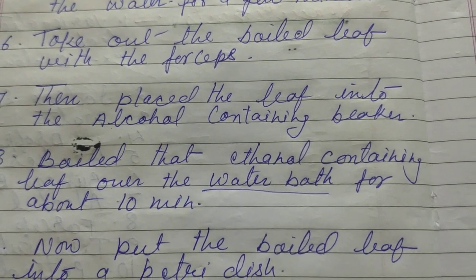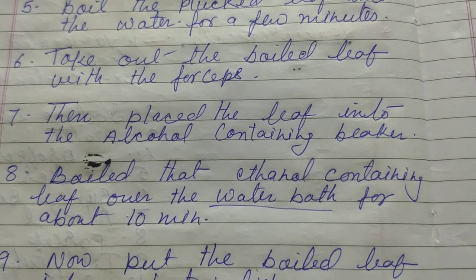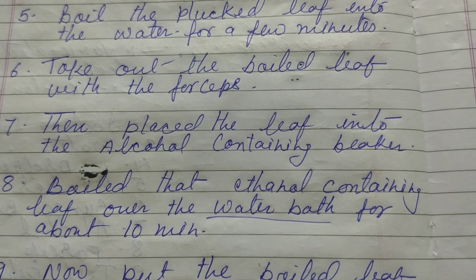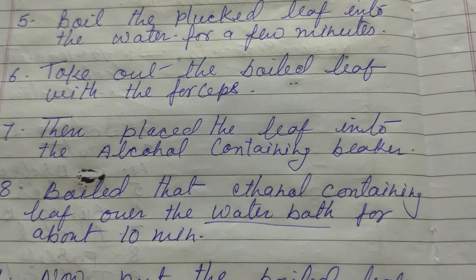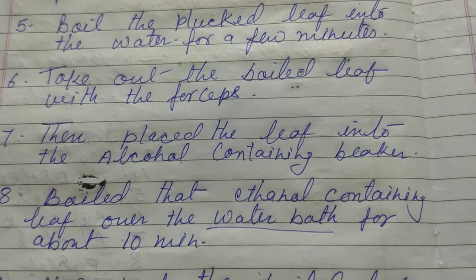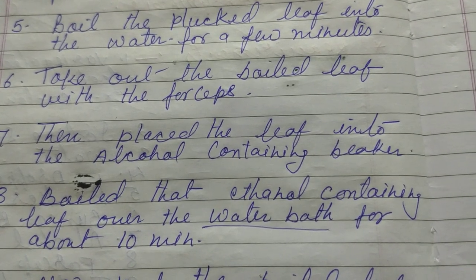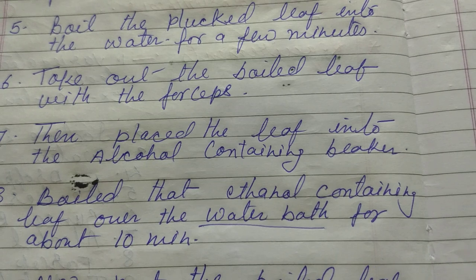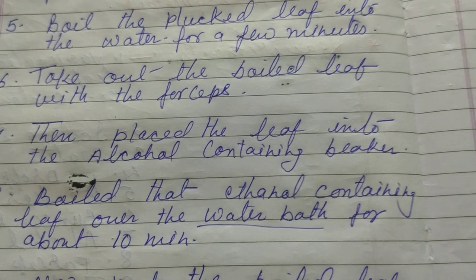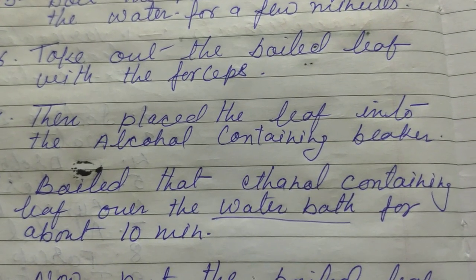Then boil that ethanol-containing leaf over a water bath for about 10 minutes. We have to use a water bath — meaning we cannot put the test tube directly on the burner because alcohol catches fire very quickly. So we take a beaker with water, put it on the Bunsen burner, let the water boil, and then place the test tube into that beaker with water. Let it boil for about 10 minutes.